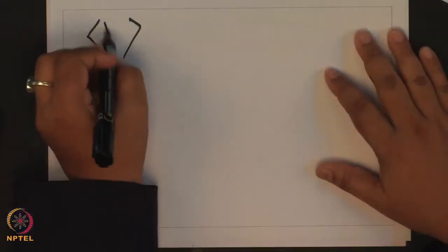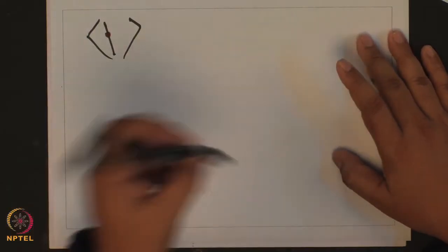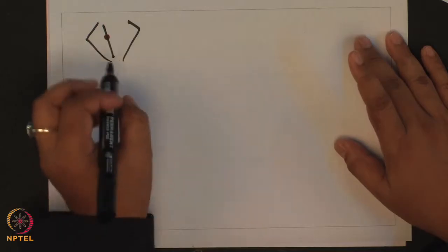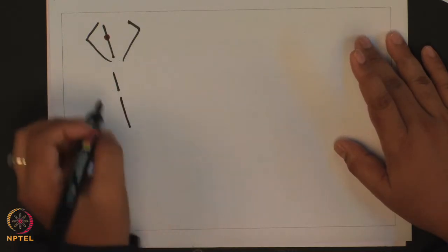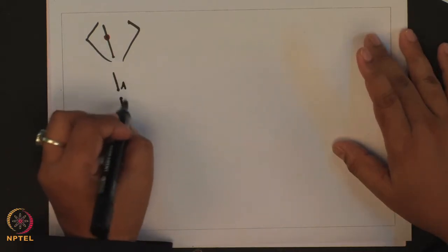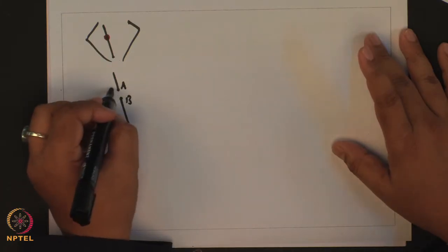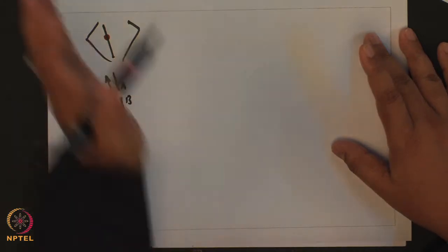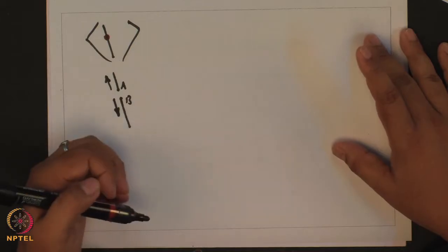So, imagine I have this cell and this is one such stress fiber in which I have focused light at this single point, and you acquire the fluorescence images as a function of time. What you will see is this stress fiber will relax. Both these ends A and B, where you have locally disrupted the stress fiber, will retract. This point will retract along the line backward, and this point will retract along this line in this direction.